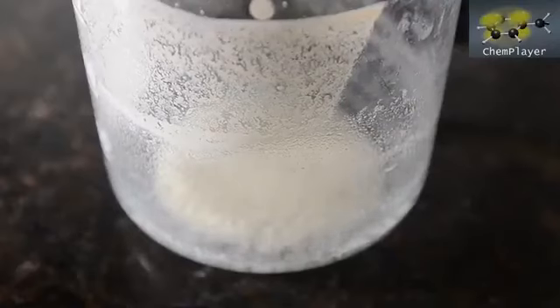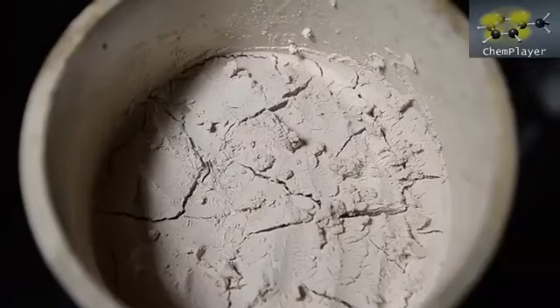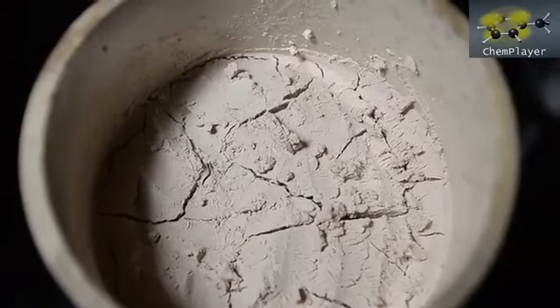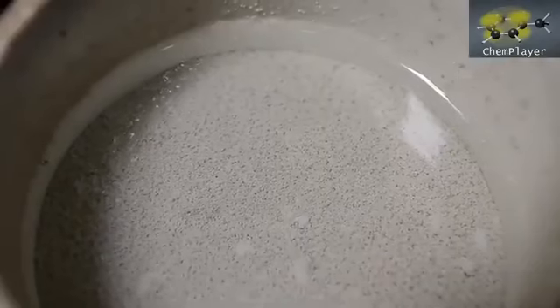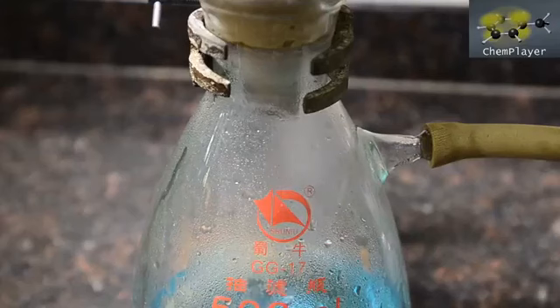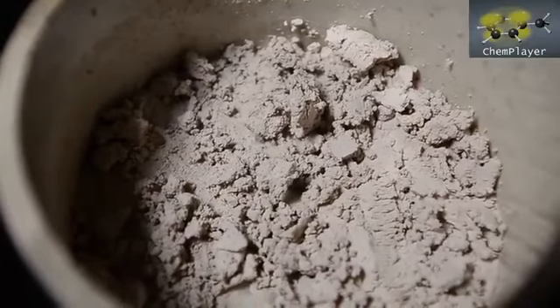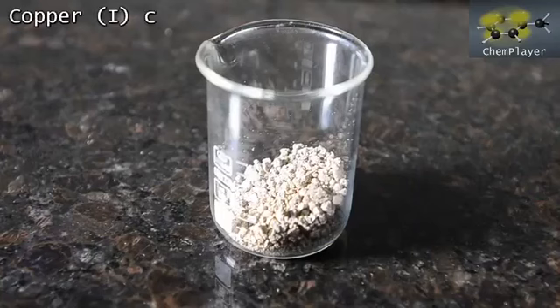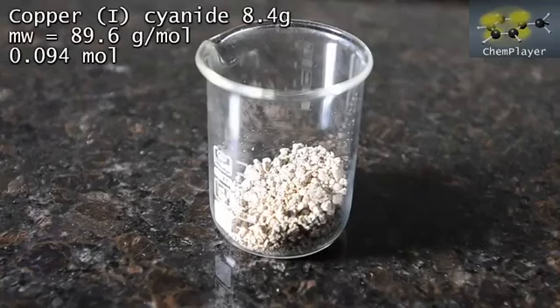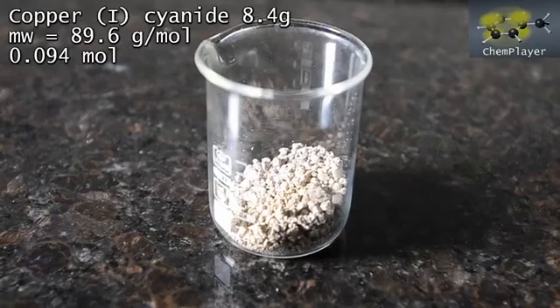We wash the beaker out with water. And then wash the precipitate with copious water. We finally dry the precipitate in the oven for 3 hours at 120 degrees C to get it completely dry. And here's what we're left with. A lumpy but dry cream-colored solid of copper 1 cyanide. It's fairly dense and we've got 8.4 grams of product here.